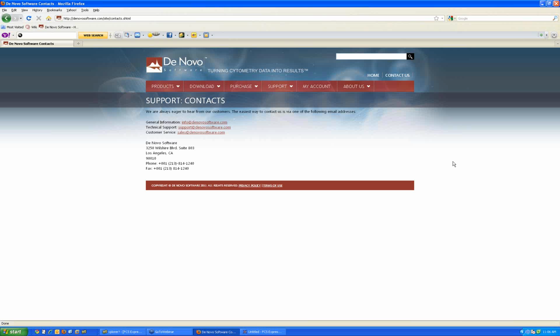You can do post-acquisition compensation in version 4 the same way as in version 3. Stay tuned to that in version 4. We have some pretty exciting enhancements that will be released shortly to the auto compensation setup. We still have plans of improving the compensation for version 4. But right now it works essentially exactly the same as version 3. There are some small enhancements to that.